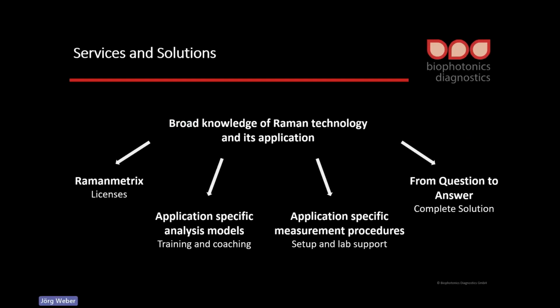What we offer to our users and customers is, on the one hand, the RAMANMETRIX in the kind of licenses, online version and desktop version, and on the other hand, complete support for solutions with Raman spectroscopic technology. On the way from left to right, there are different possibilities with training, for example, or coaching in application-specific model building, and also support in setting up measurement procedures or databases where the analysis and modeling are based on later.